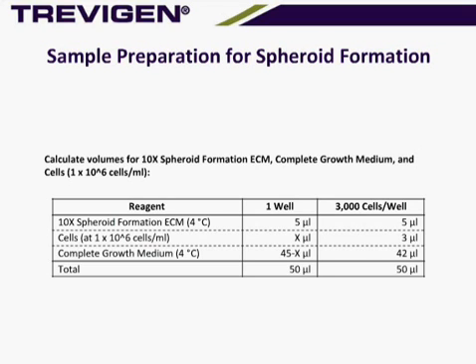And this is an important point to mention, that different cell lines have a different size, and generally what we're looking to do is create a spheroid of a specific size, so between 400 and 600 microns in diameter. This is where we see a lot of these physiological gradients created. So this may require a little optimization based on your cell model.